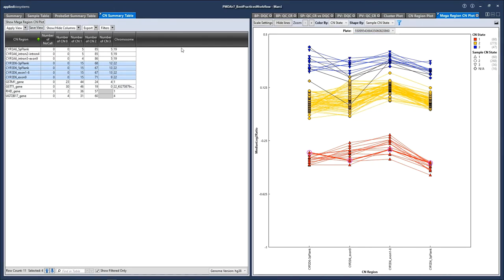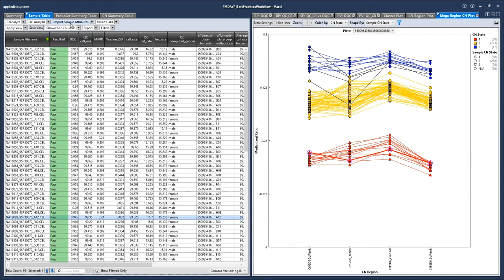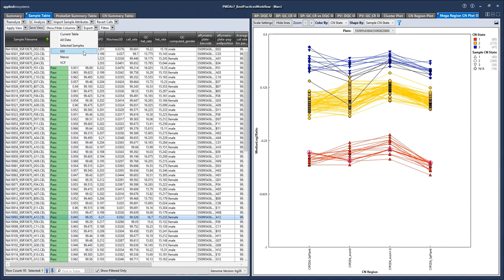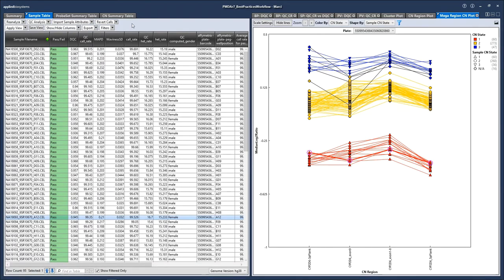There are additional exporting options available from the sample table. The top three options in the export drop down are for the QC metrics from the table, but we can also export our copy number data for visualization in IGV format or Nexus format, or we can create a VCF file. To review, what we've been looking at so far is a fixed regions copy number analysis that is part of the best practices workflow output for the PMD array. In addition to the fixed region copy number data, the best practices workflow also contains all genotyping data.